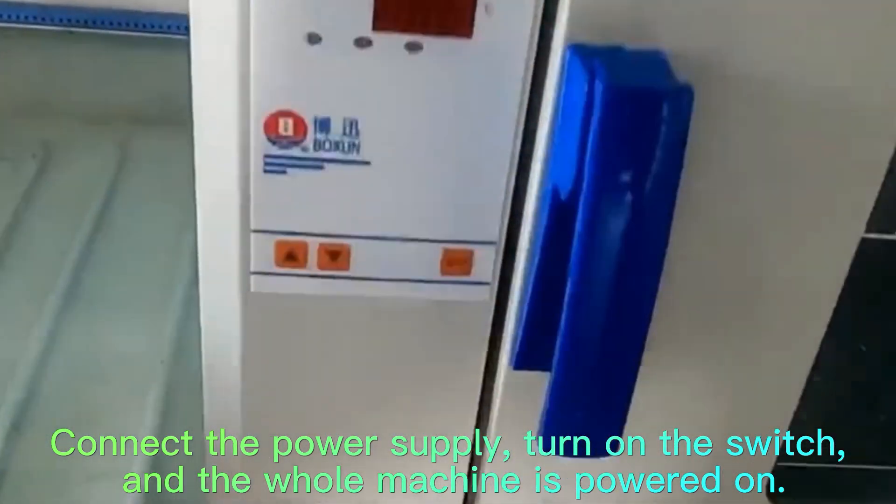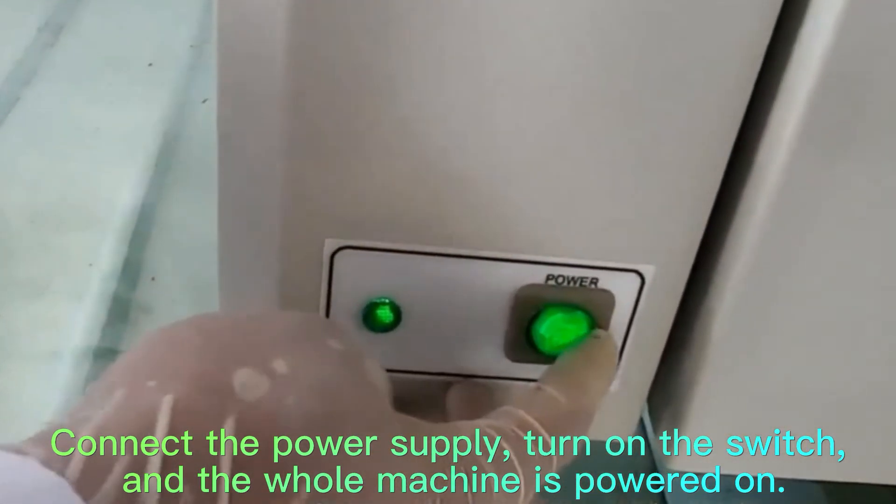Connect the power supply, turn on the switch, and the whole machine is powered on.